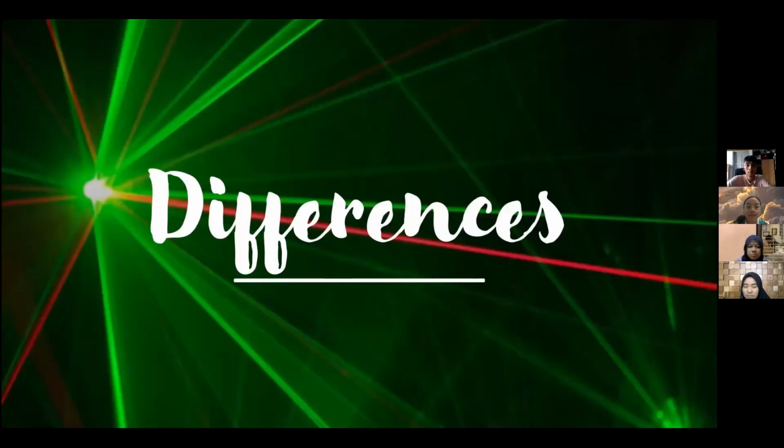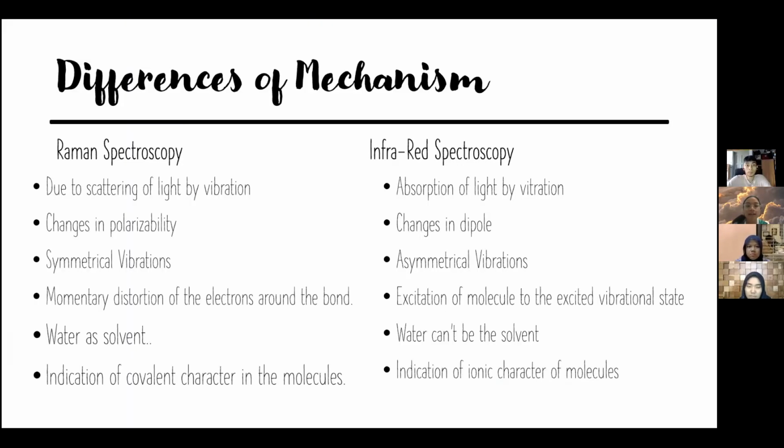So, continuing with the differences. We do know that generally there are a lot of types of spectroscopy in analytic methods. The difference between Raman spectroscopy and infrared spectroscopy is the formation of the light. Raman is due to the scattering of light by vibration, while infrared is absorption of light by vibration.